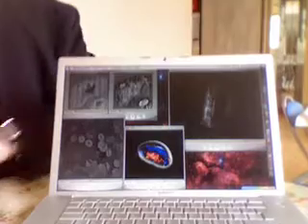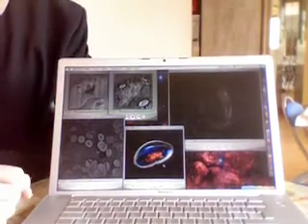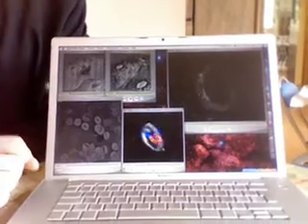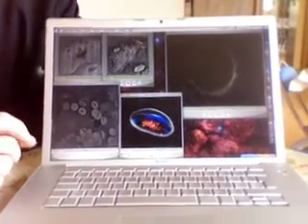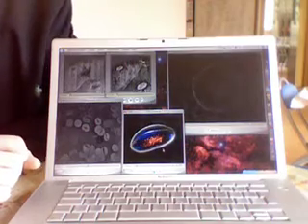Do you have some pictures of that microscope? Can you show them? Okay, so this is the picture. Could you please explain this? Yes. The idea of this microscope is to image transparent specimens without any staining, like in fluorescence microscopy.